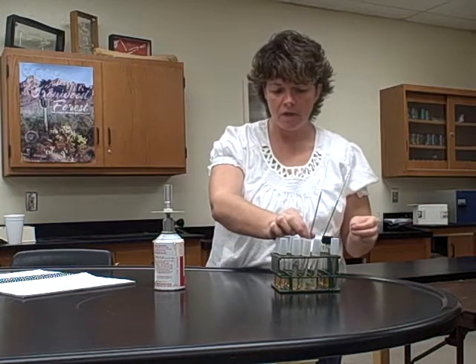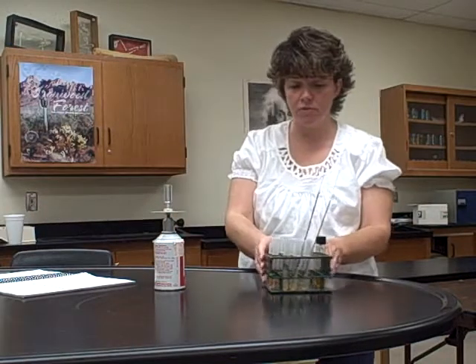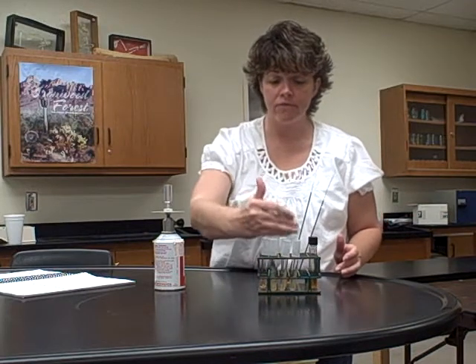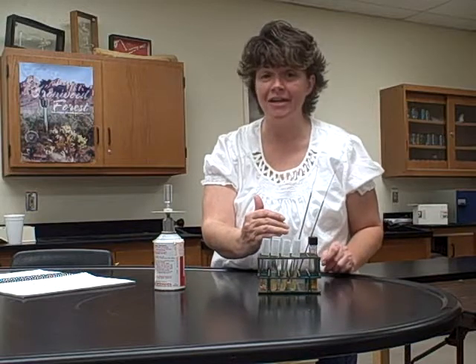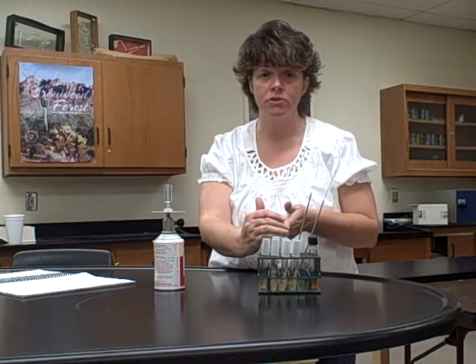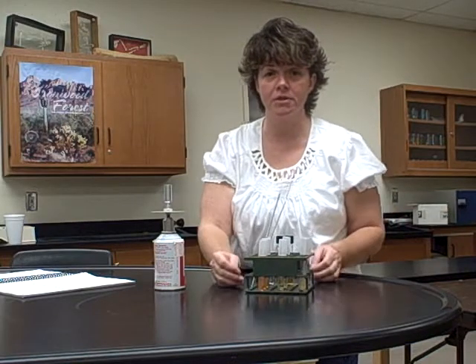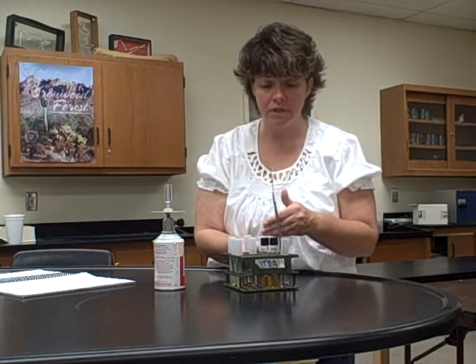Also for that, you're going to need several different tubes. On my rack right here, I have 12 tubes. I have 9 media tubes that you're going to put bacteria into, and we call that inoculation. When you take bacteria from one tube and put it into another, it's called an inoculum, and you are inoculating those tubes with the culture, okay? So these 9 tubes right here are the tubes that I'm going to be inoculating, and these 3 tubes here represent the bacteria that we are going to put into the tubes.